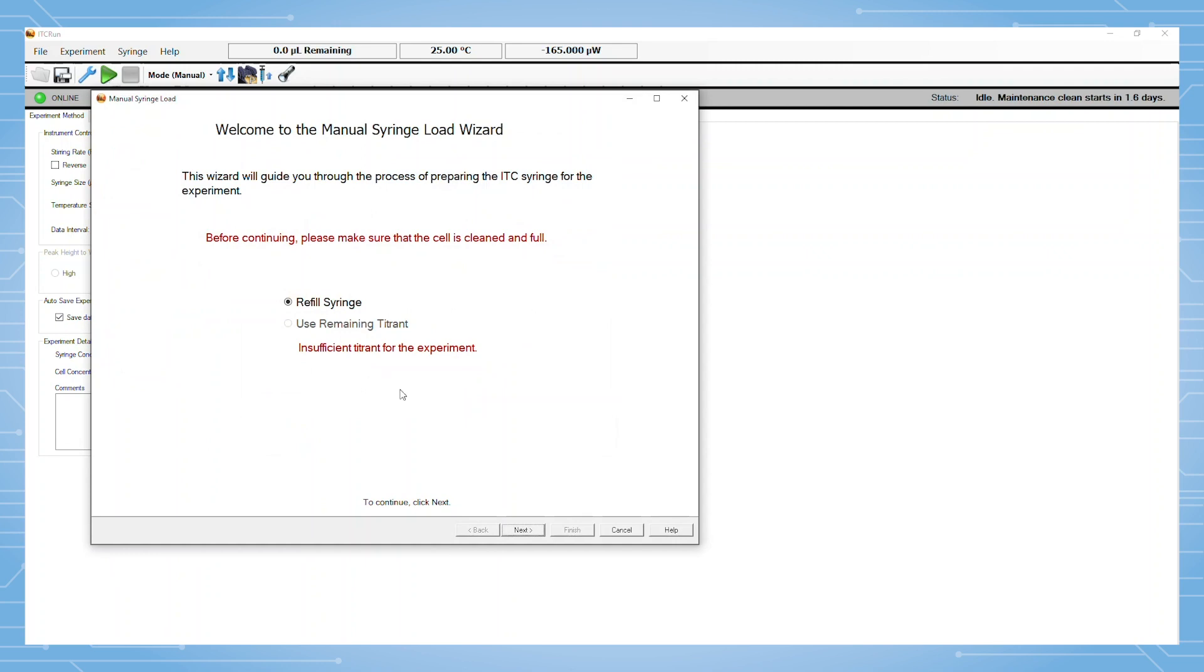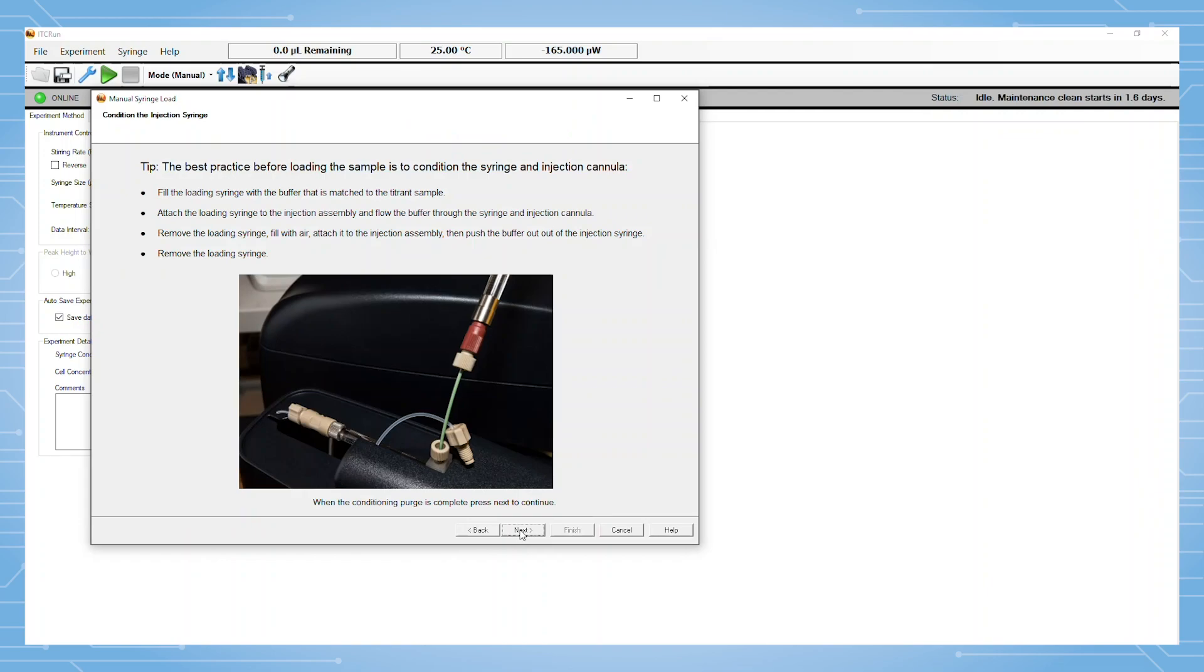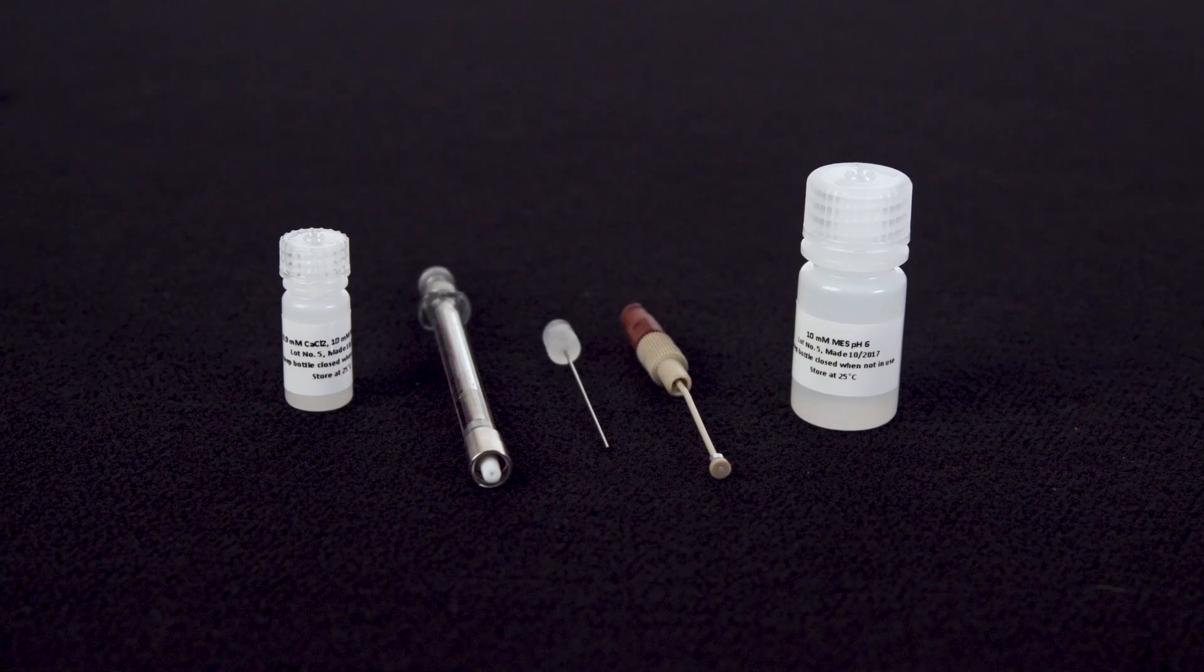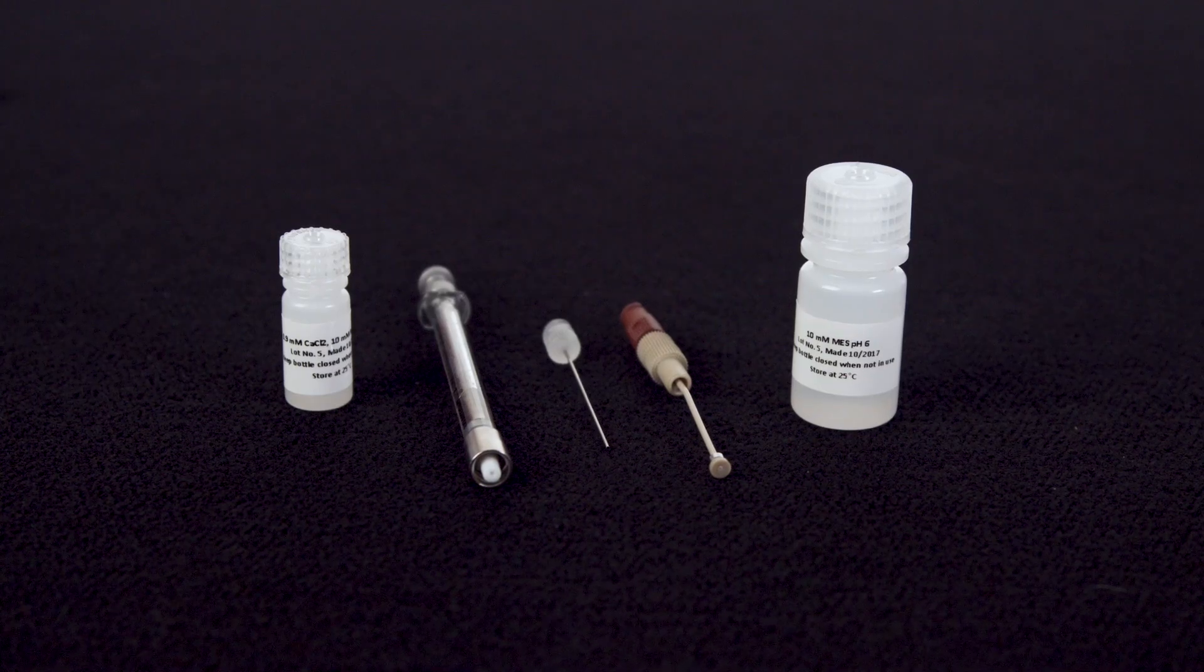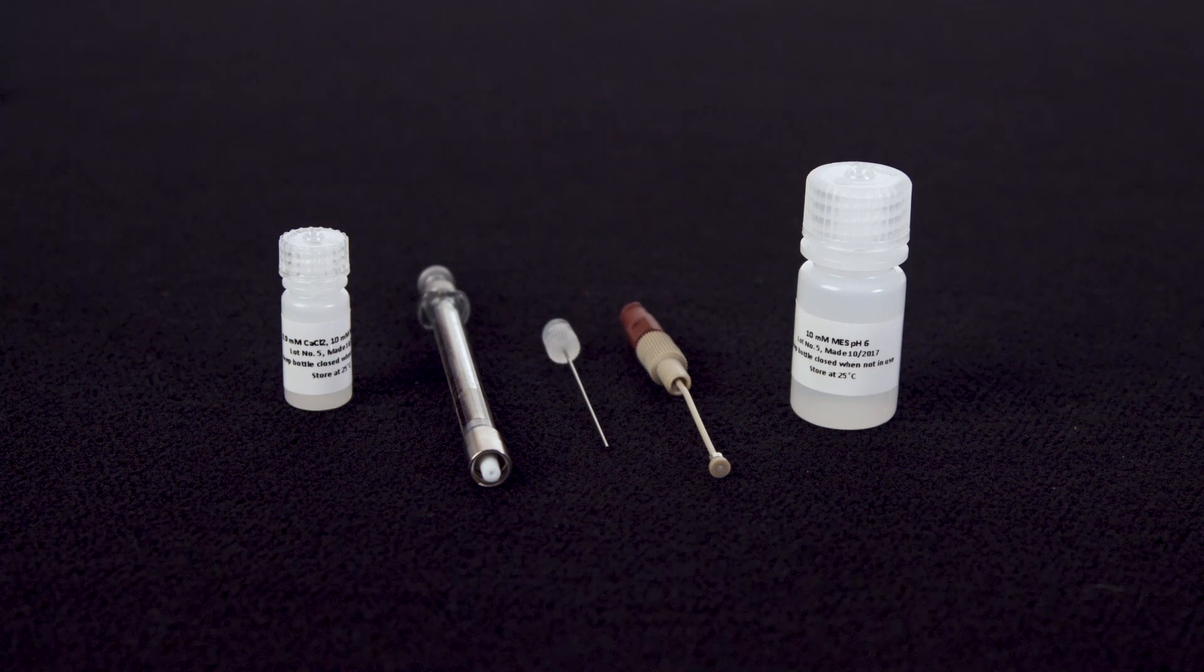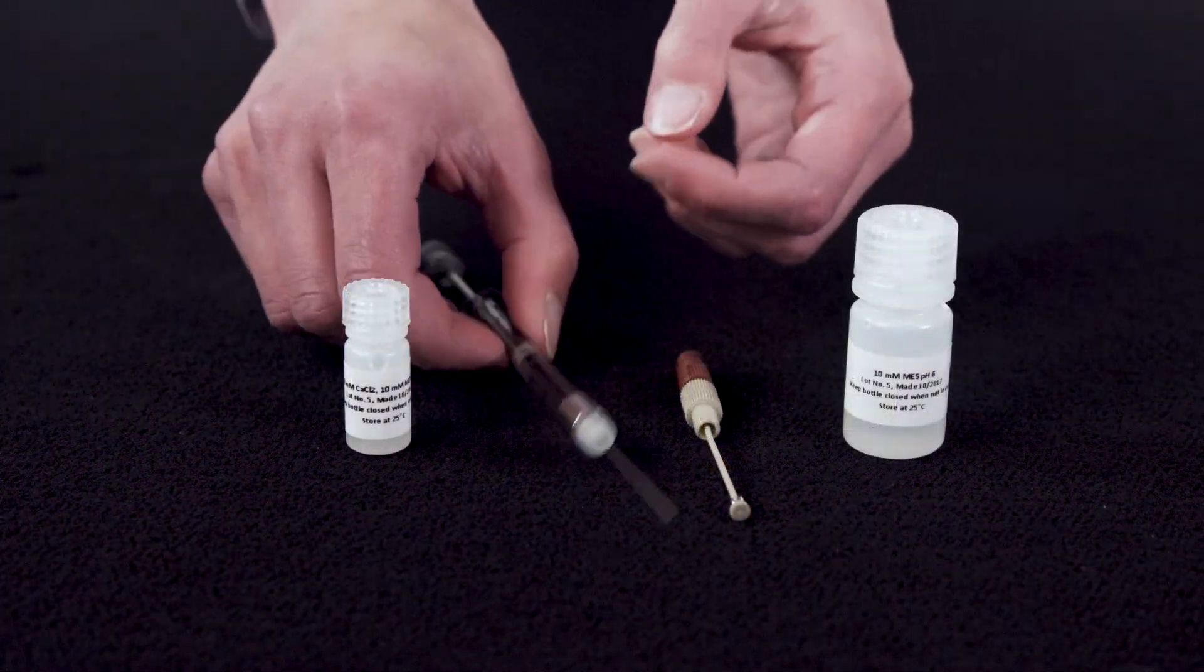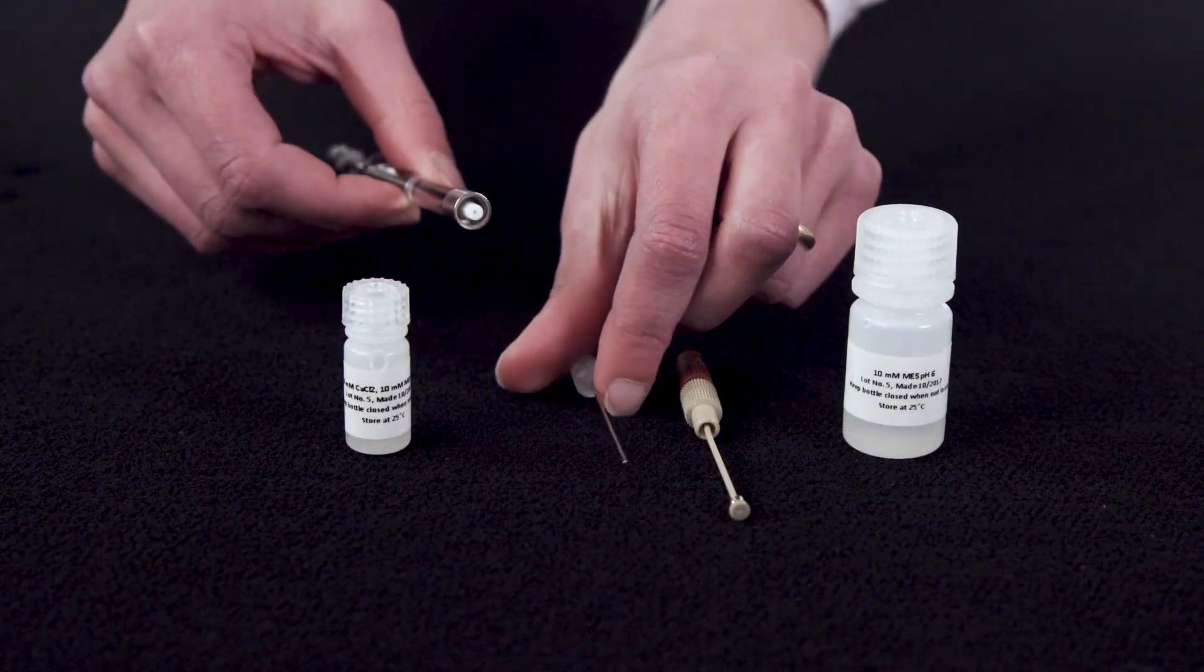The wizard prompts the user to load the cell if they haven't already. Use the needle and filling syringe with 200 to 500 microliters of the buffer that you're using for the experimental titration. Remove the needle and replace it with the adapter tool.